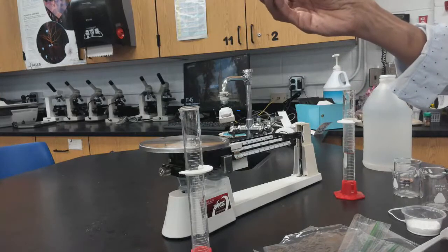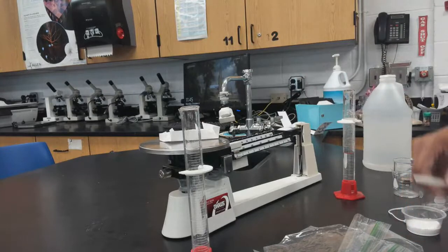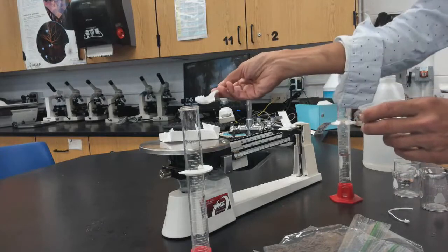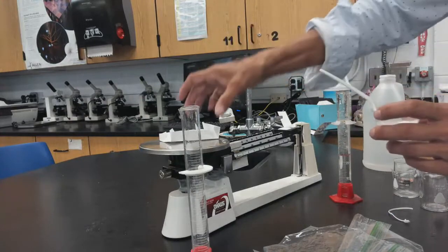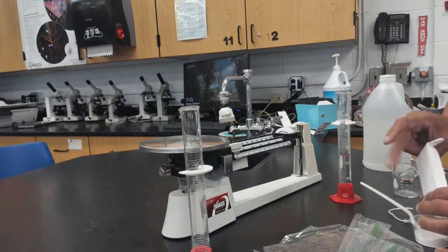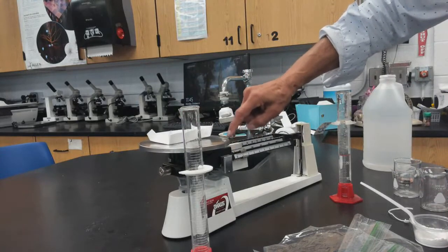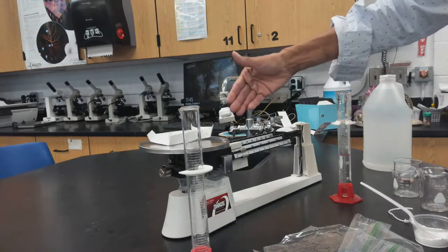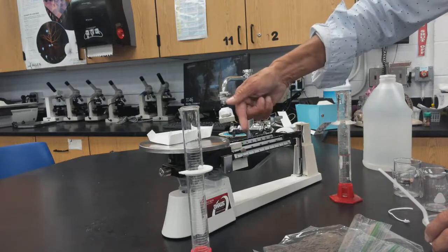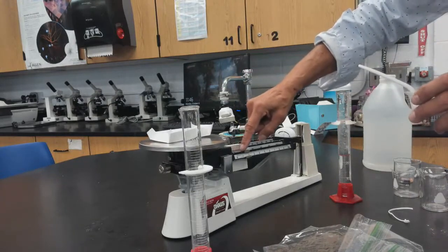You'll create a data table. Take the weigh boat and put four to five grams of sodium bicarbonate into it, making sure not to spill any. You must record the weight of the weigh boat — otherwise you'll include it in your measurement. If using a digital scale, you can zero it out. This weigh boat is 1.1 grams.